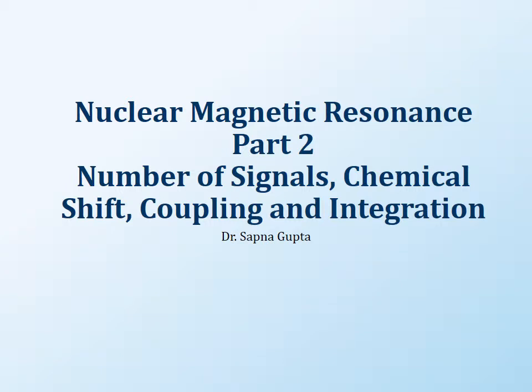This is the second part of the NMR, and now in this case we will start talking about the number of signals, a little bit more about chemical shifts, coupling, and integration. So we will cover almost everything regarding the proton NMR.